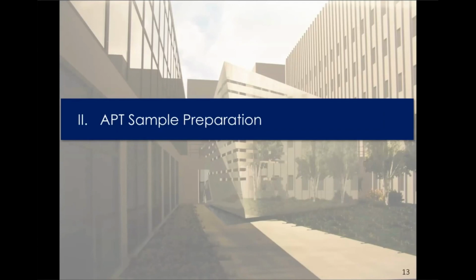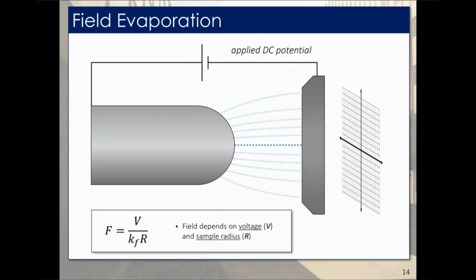Well, to talk about atom probe samples and what their requirements are, we have to step right back to talking about field evaporation. Field evaporation, as I mentioned earlier, is the tendency of atoms to ionize in the presence of a strong electric field. Well, how strong an electric field? What we actually need for most elements is an electric field on the order of tens of volts per nanometer, which is very high. So it's difficult to get that field strength onto your material without, say, forming an electron beam backwards from your counter electrode.